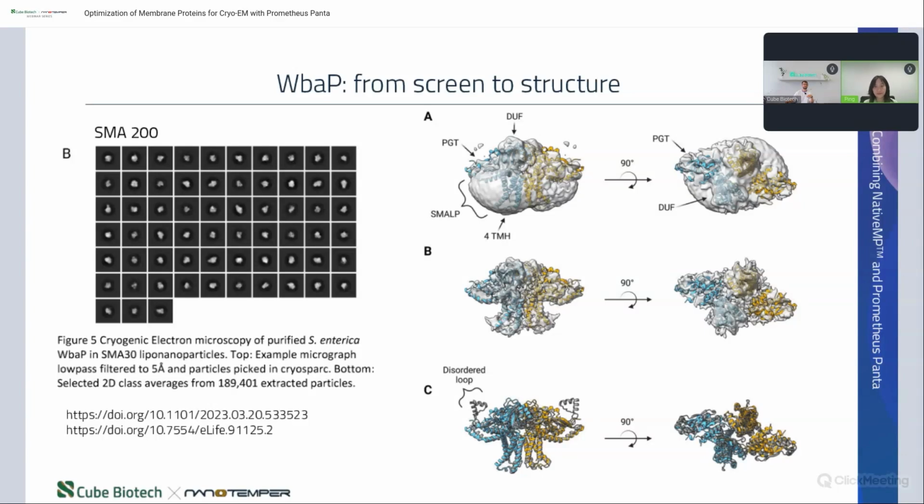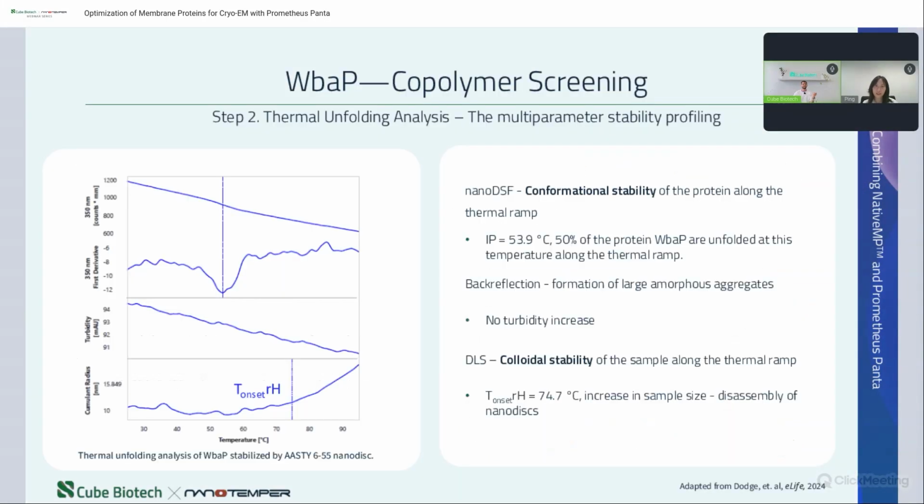Yeah, especially, this reminds me day after day when I use the device. We use it in the lab every day here. We're very happy to have it. Just don't pick based on the yield or just the SDS band intensity alone. It's really this downstream compatibility that truly matters if you want to do structural biology, because let's be honest, it's really, really hard. So let's go to the next slide.